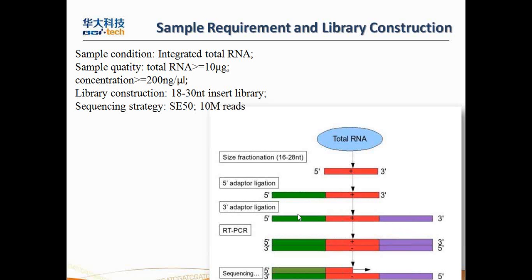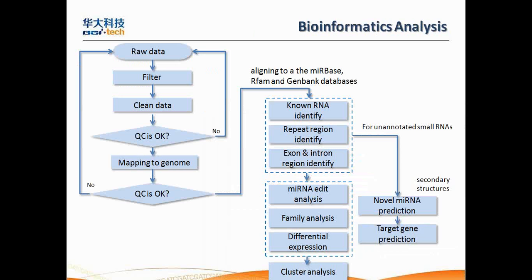After the ligation, we do PCR amplification of these RNA fragments, and after the amplification, we do the sequencing.